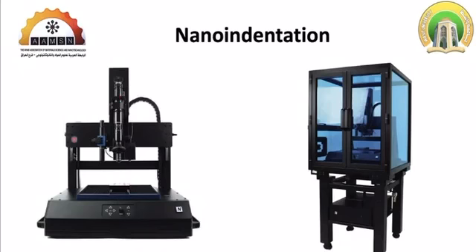So under this configuration, the tabletop compact machine needs to be kept inside a box and needs to be mounted on an anti-vibration table.